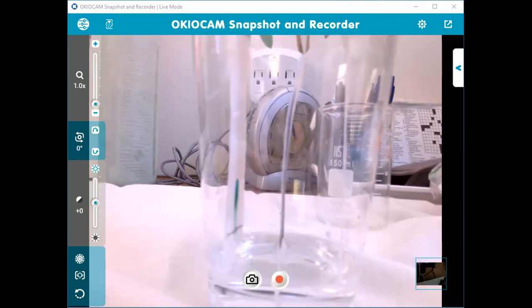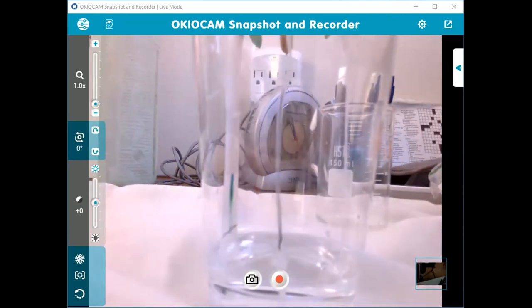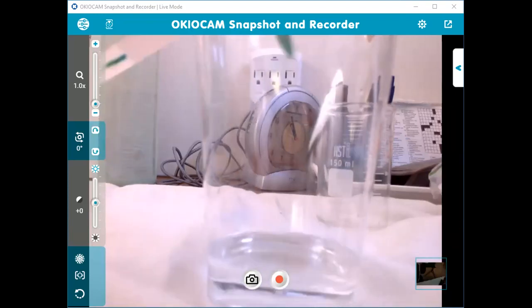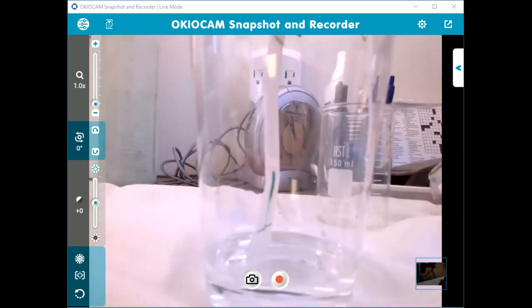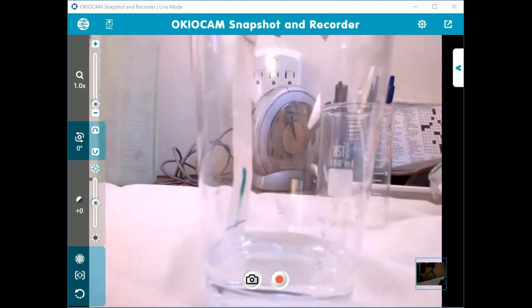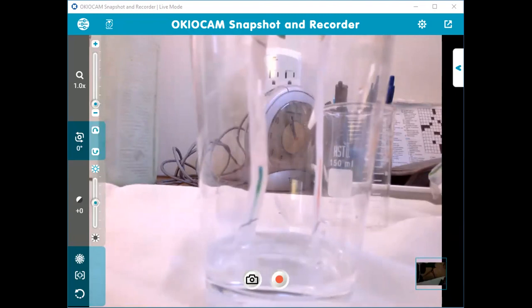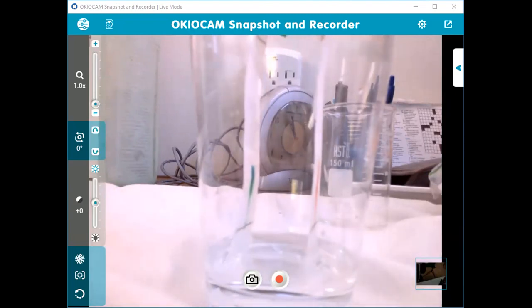You want to catch the water level right before it hits that finish line, which is that top line you had drawn at 8.5. Right before it hits the finish line is what you're looking for. And if, for example, you take it out before the finish line, that's okay too. This is an example where I took one out before the finish line, and you want to take it out and dry it.